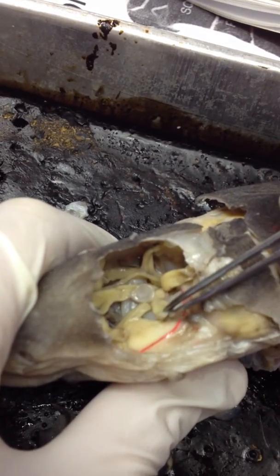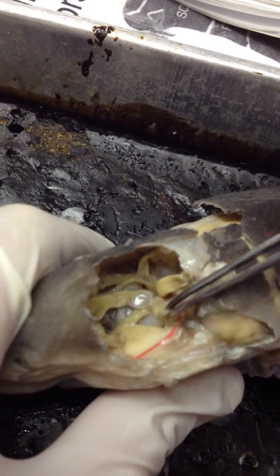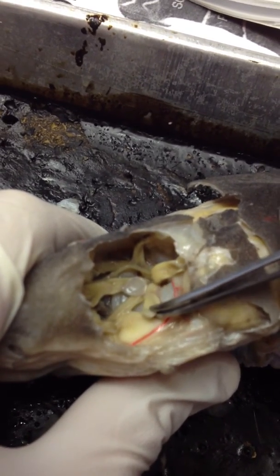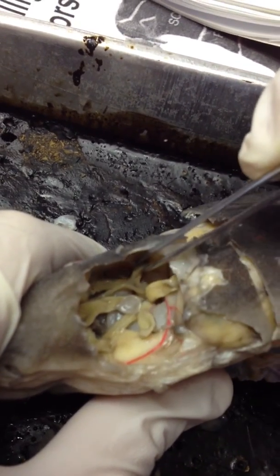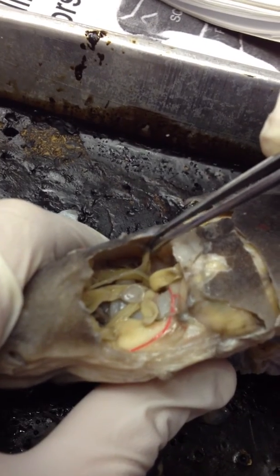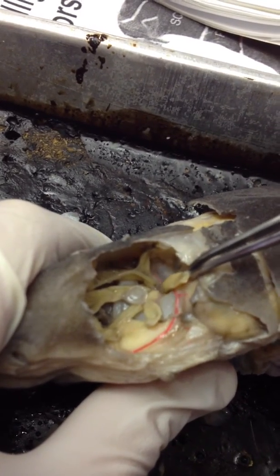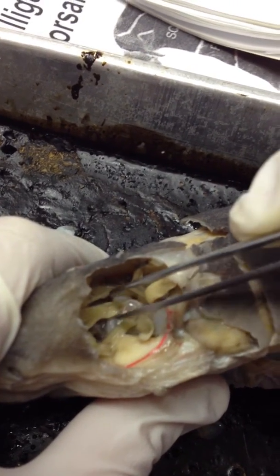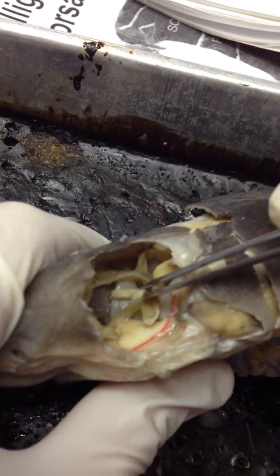We have the inferior rectus here. There are four muscles: the inferior rectus, the superior rectus, the lateral rectus, and underneath the optic pedestal, we have the medial rectus.